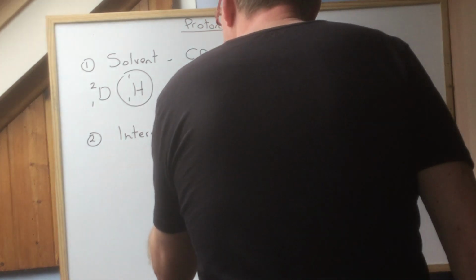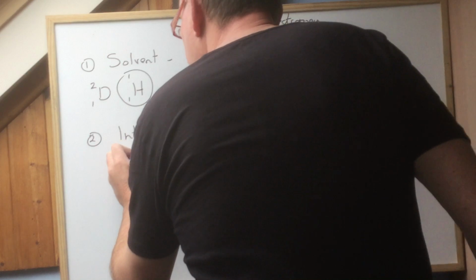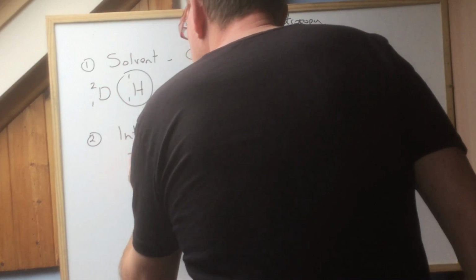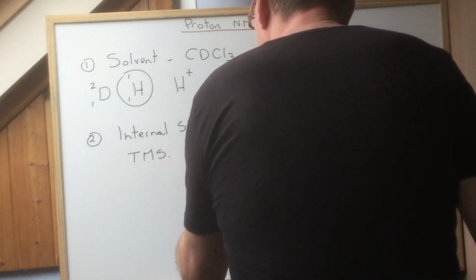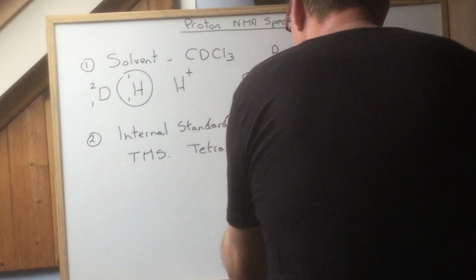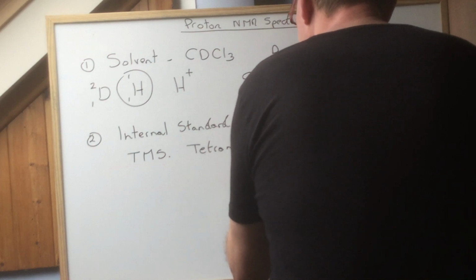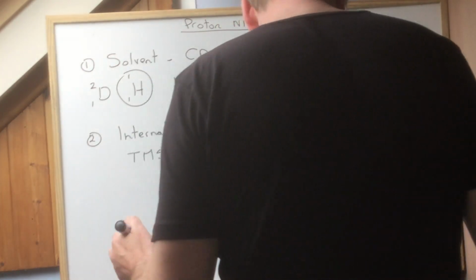Okay, an internal standard, and again, I'm sure we've met this, is called TMS. Tetramethylsilane. Silane. TMS. Okay? What on earth is that?